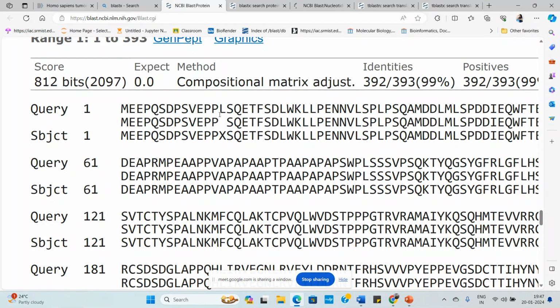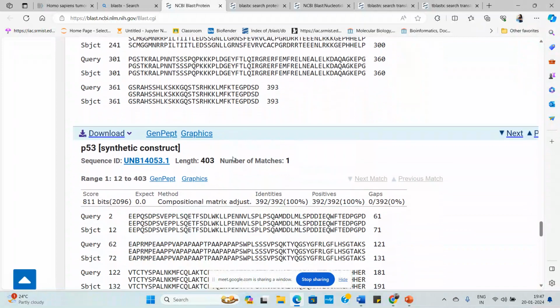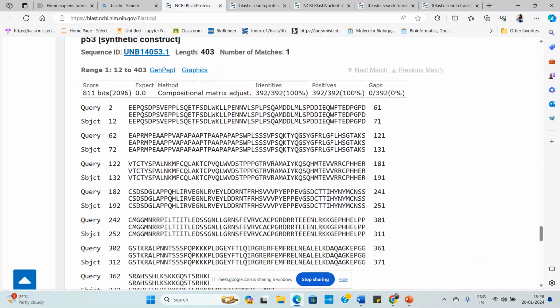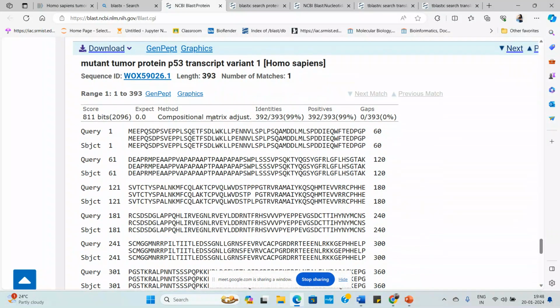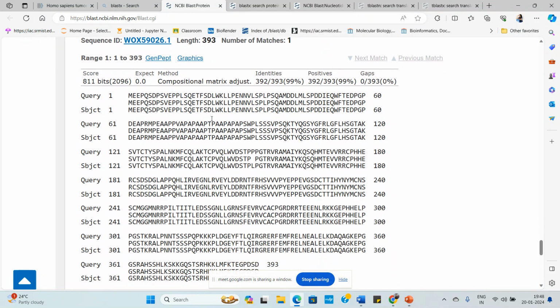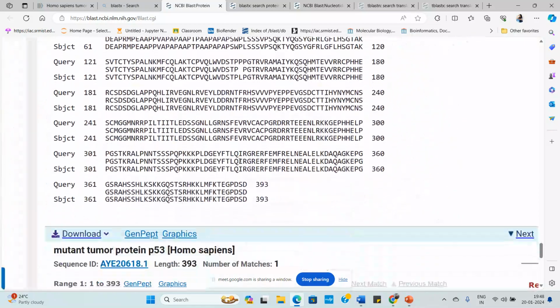These are two different proteins coming here, so we call this a space. All this space, gap, match, mismatch, everything will have some scores which the matrix will align, and it will give it in identity.